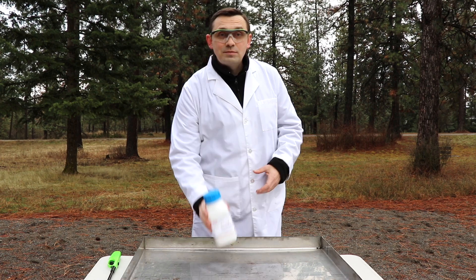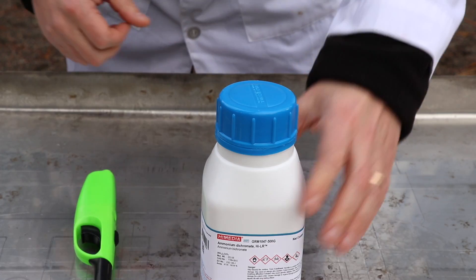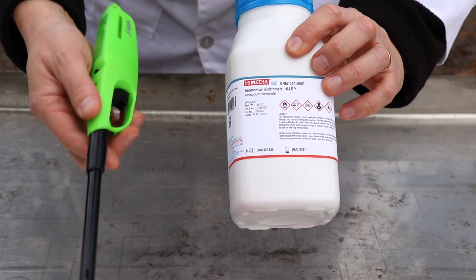Hello friends, how you all doing? In today's video I'm going to show you how to make a volcano-like chemical reaction using ammonium dichromate. For this experiment we'll need ammonium dichromate and a lighter.